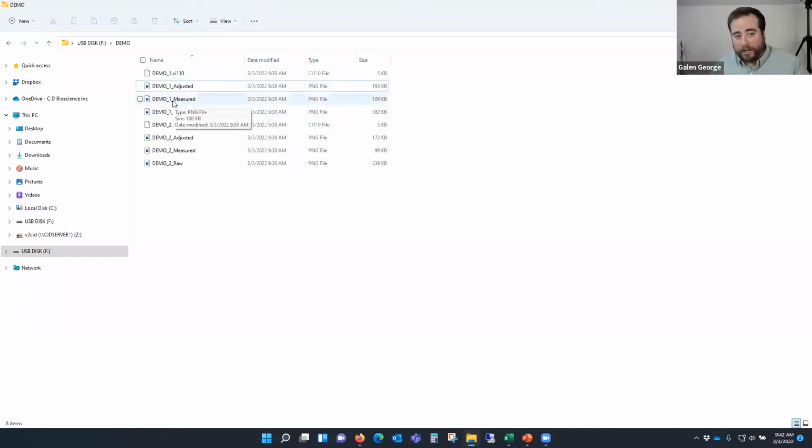There is very robust software on the instrument itself, but if you want to do some things that maybe our instrument isn't capable of, or like I said, experiment with different gap fraction methods, you can always do that with the data here.